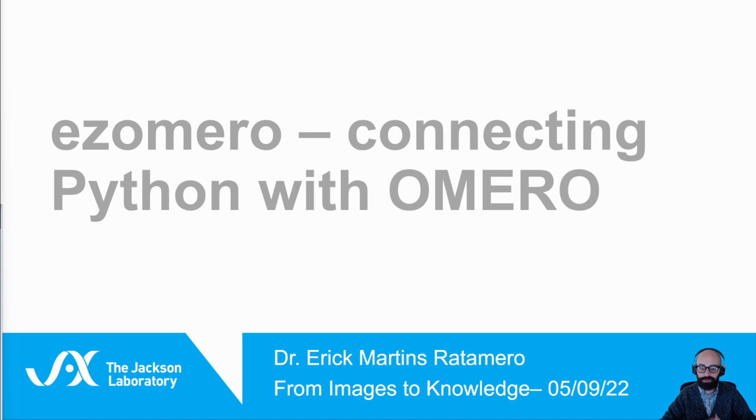So first of all, I want to thank you all for the interest in this workshop. I will go through a very short presentation on what ezomero is, describe a little bit of how it works, then I will show you some concrete examples of how ezomero works in action. If you have not gone through our setup guide, which is in the GitHub repository for this workshop, this is a very good time to do that. So pause the video and go through the setup guide.